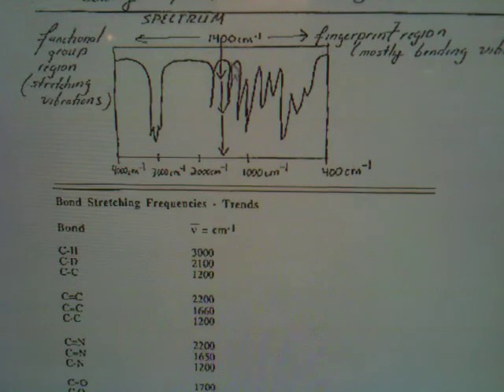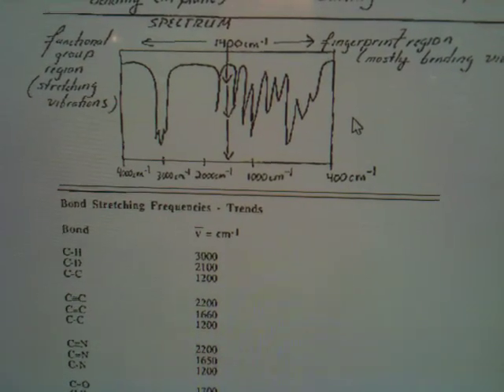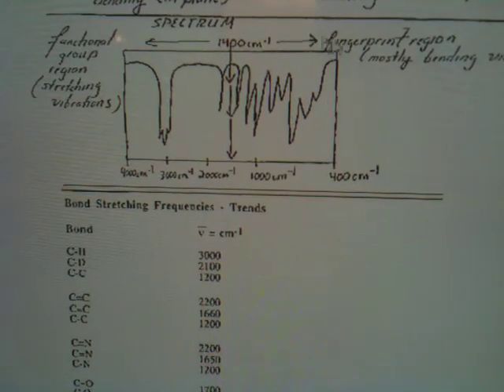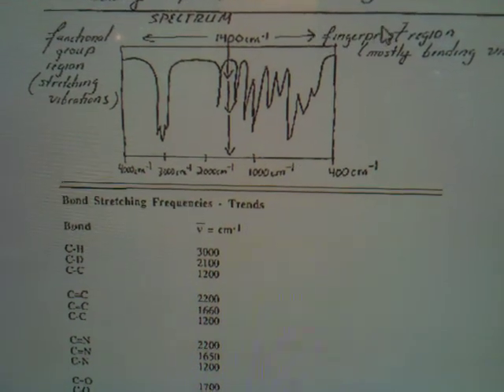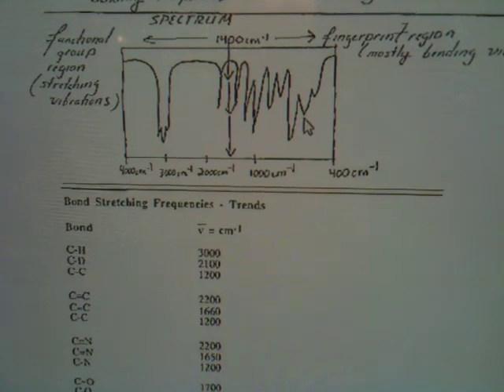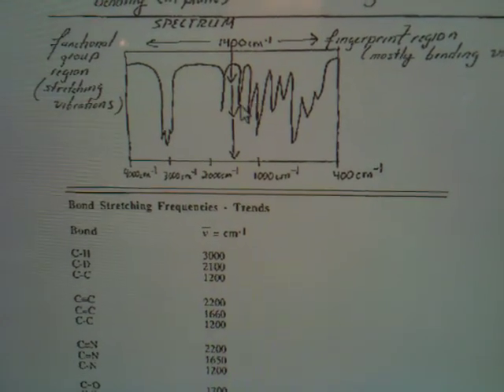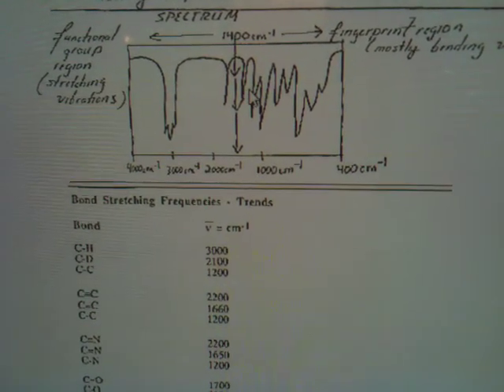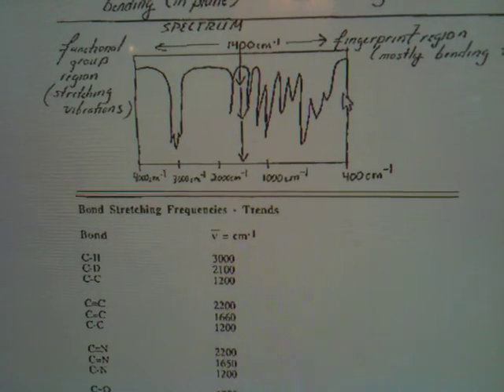Now, frequently what students use this for, in this time when you actually have NMR spectroscopy readily available to you, is that they will use this part mainly as a fingerprint of the molecule. So think about what this term means, a fingerprint. That's implying that it's very unlikely that two molecules would have the same fingerprint region. And what we mean by this is the landscape. In other words, the position of the peaks, but also the intensity of the peaks. Very unique for each molecule.